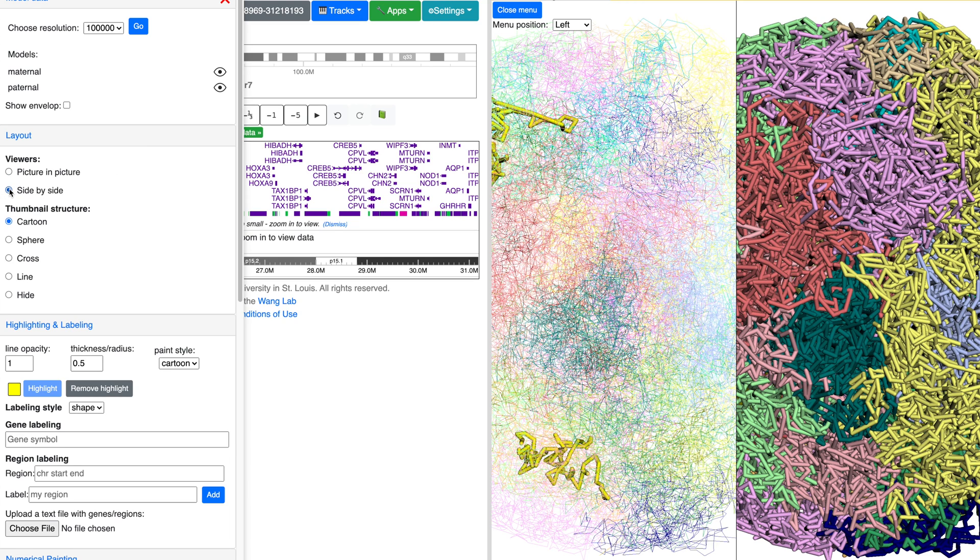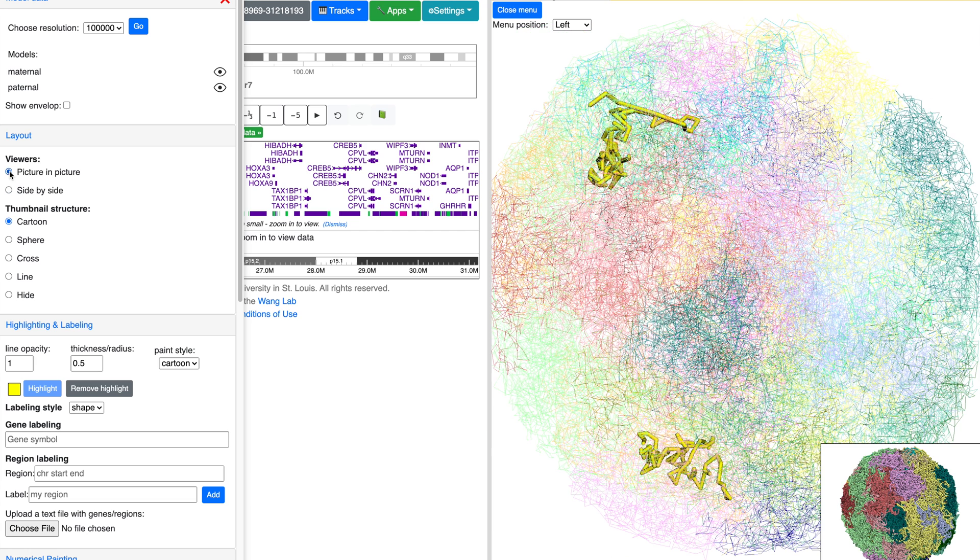To change the viewer, select Picture-in-Picture or side-by-side.